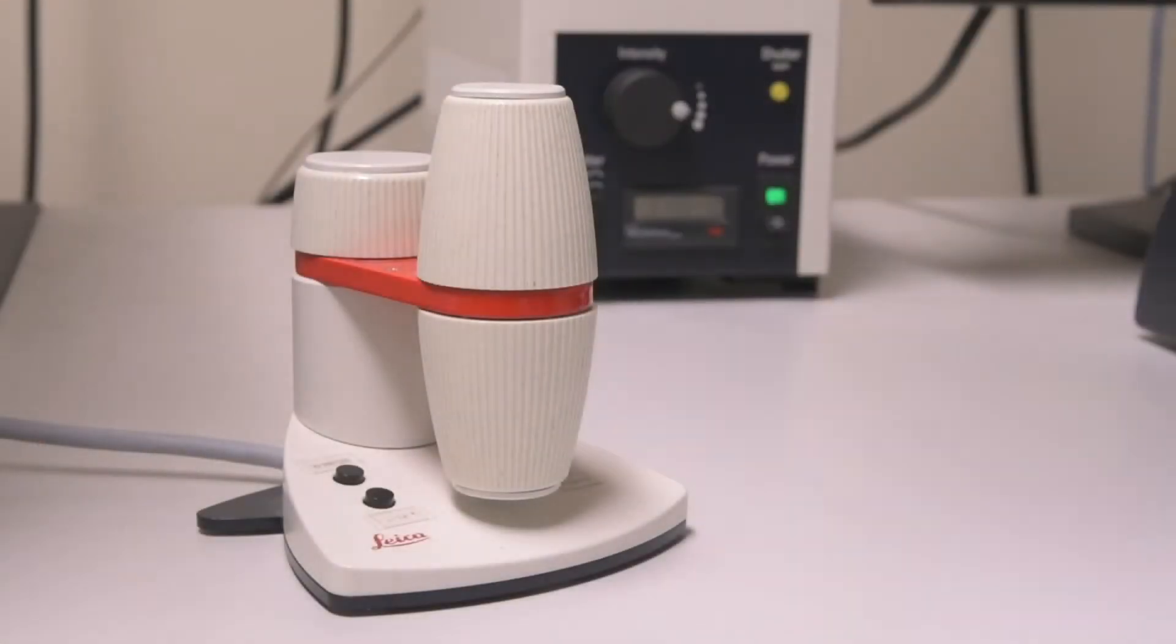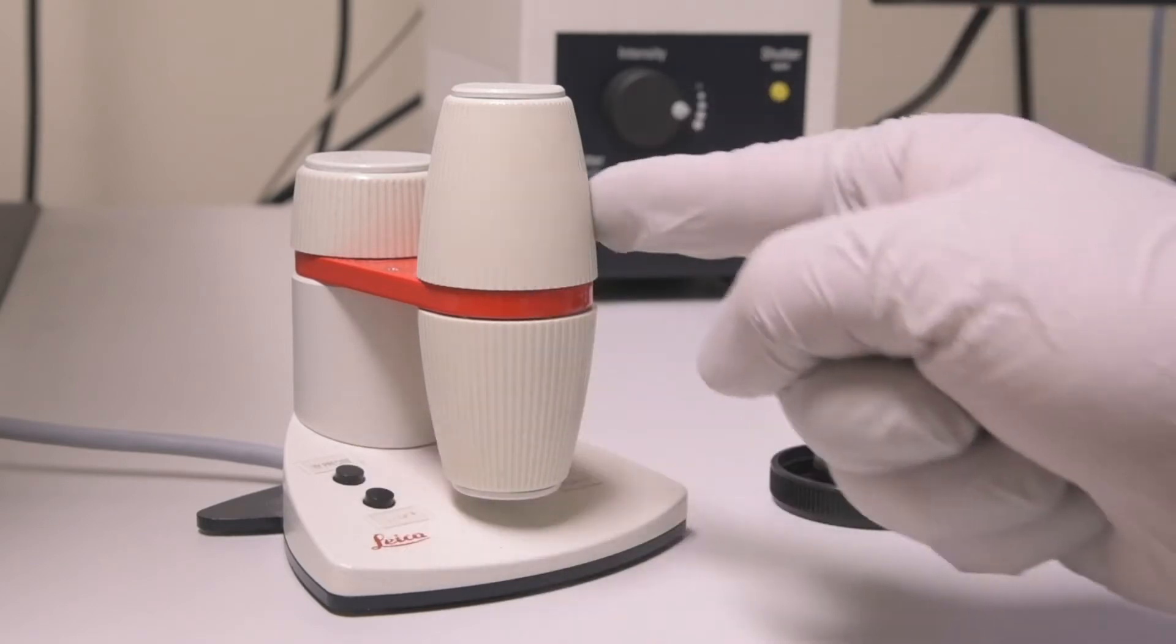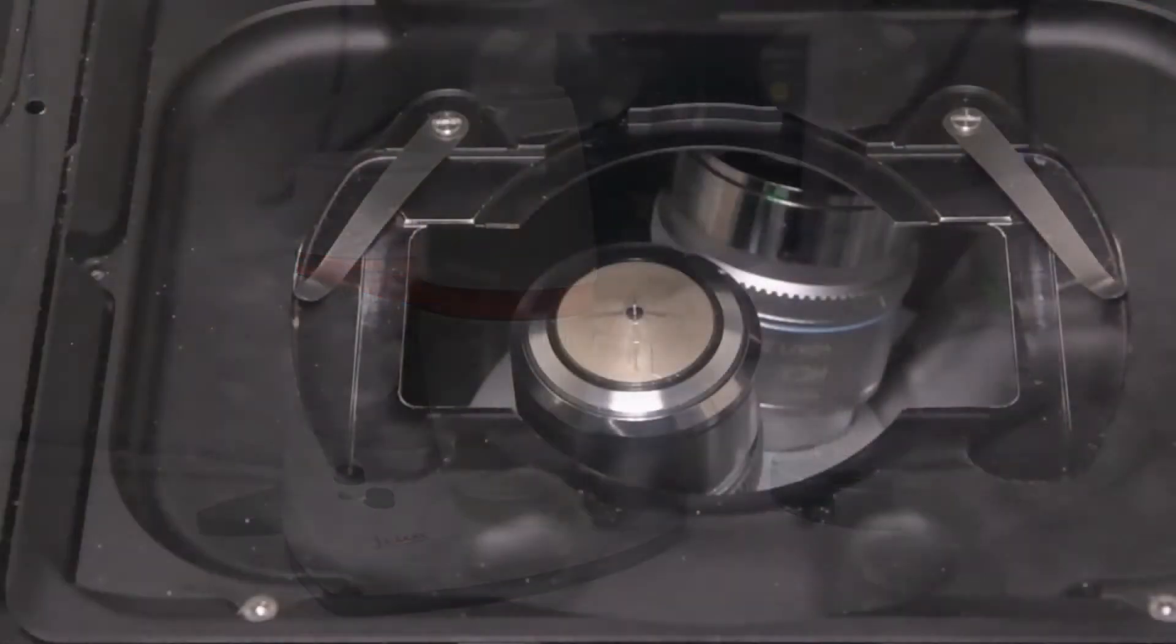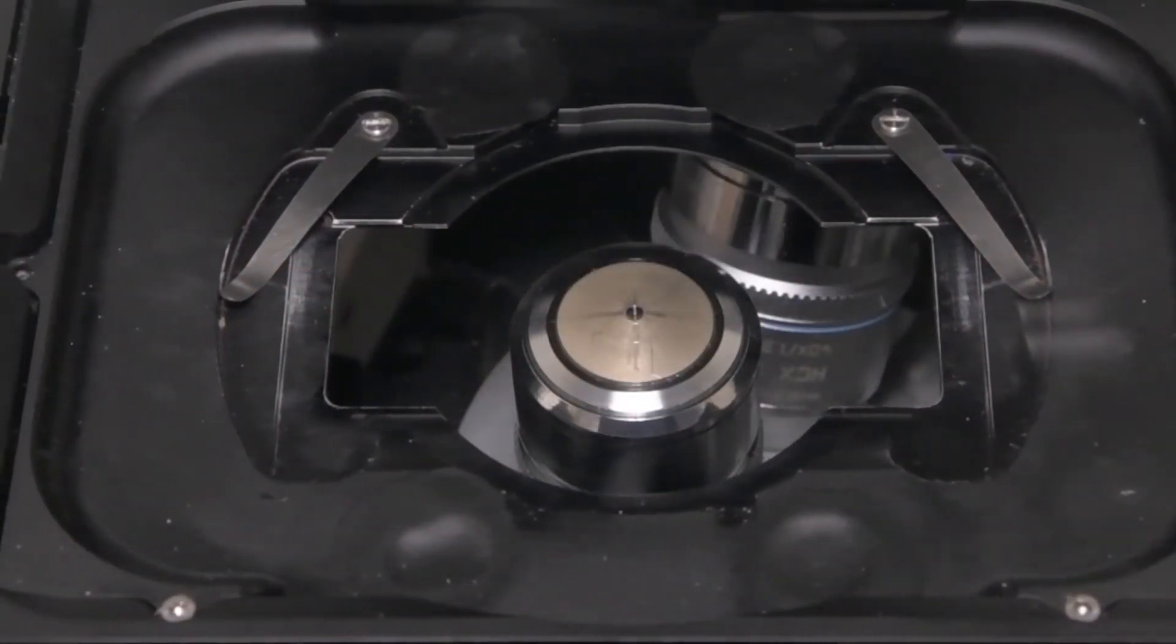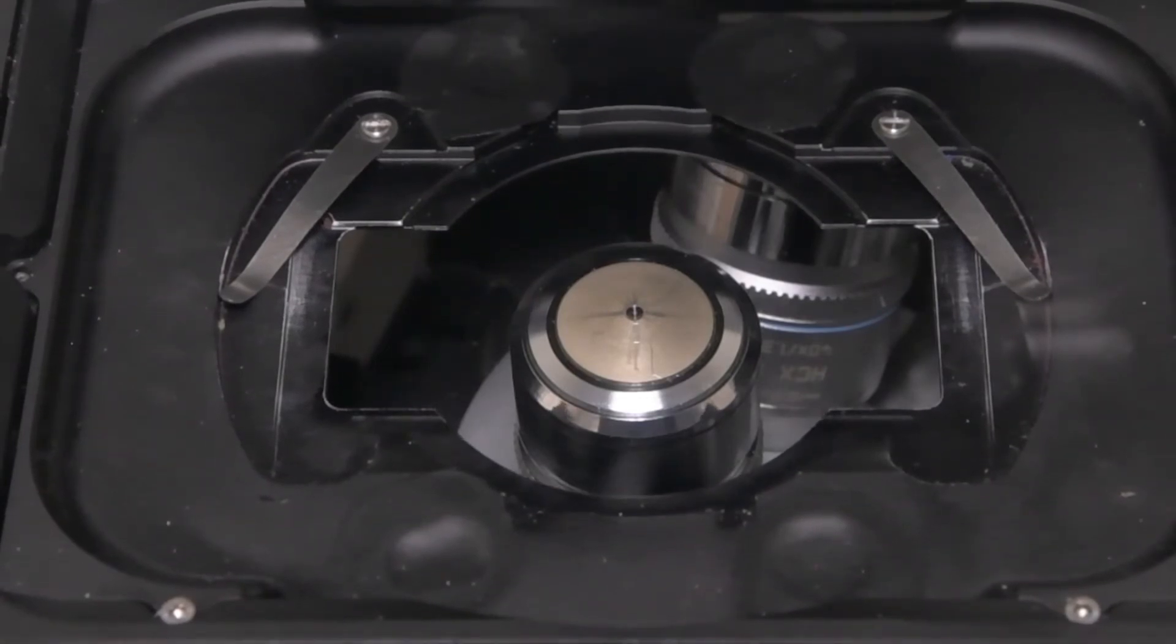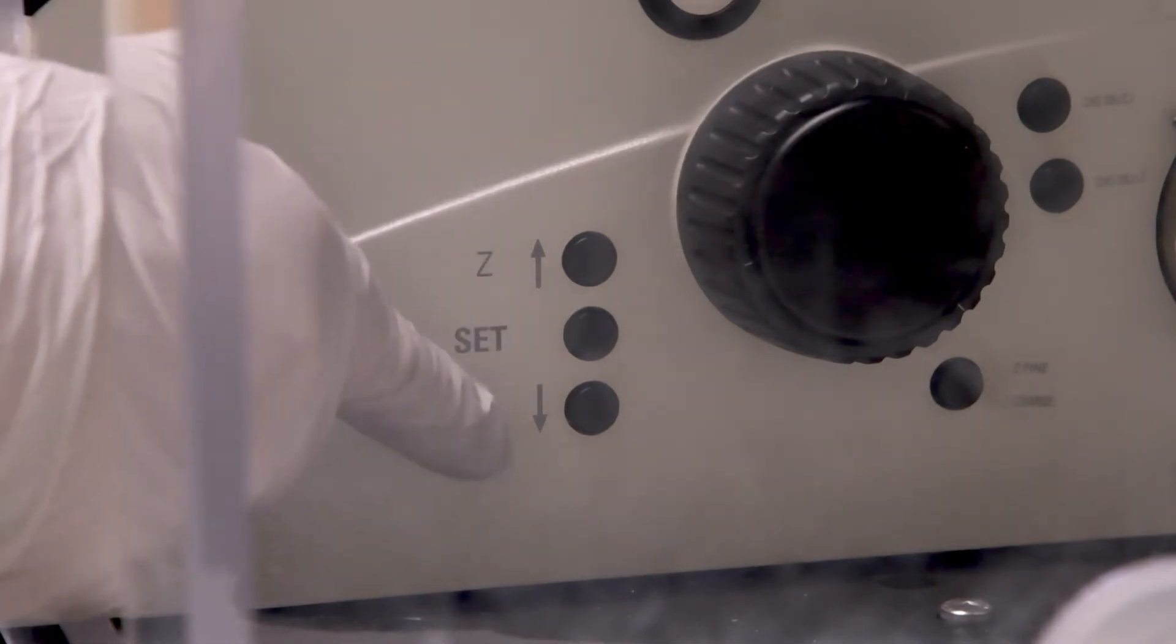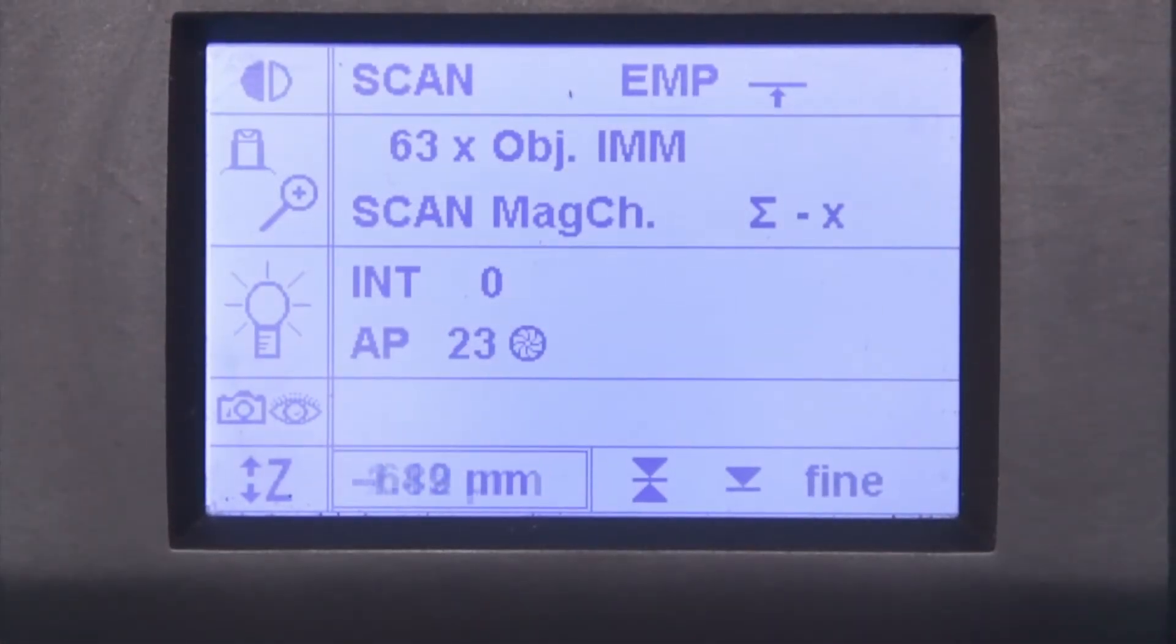If you started with the objective a little off-center, use the XYZ controller, click the course button, and move the stage, so that the objective is right in the middle of the opening. Look on the right side of the microscope and locate the three buttons towards the front again. Push the top button. This will bring the objective up to the zero set point.